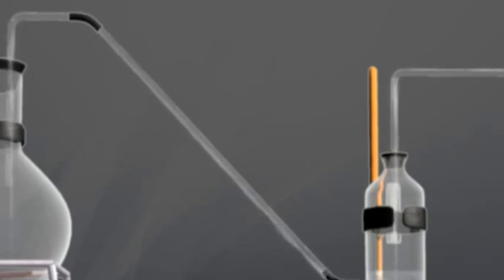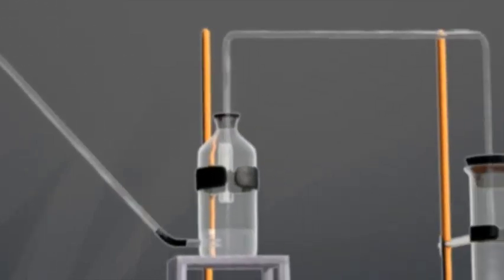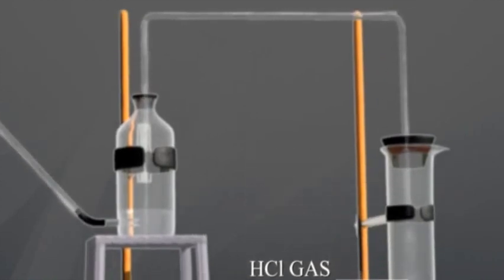Now this dry HCl gas is collected by upward displacement of air in the jar, since it is 1.27 times as heavy as air and is very soluble in water.